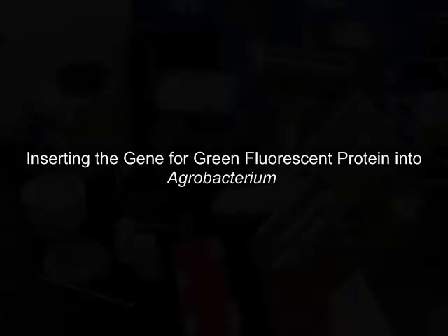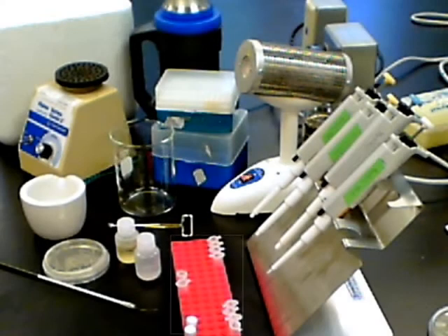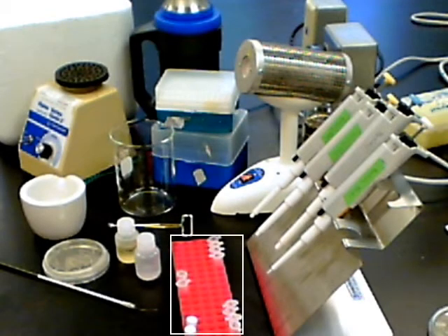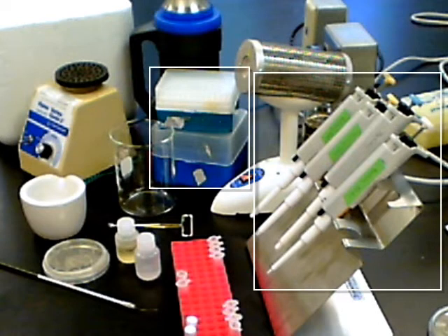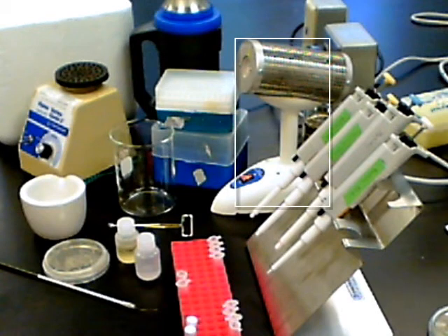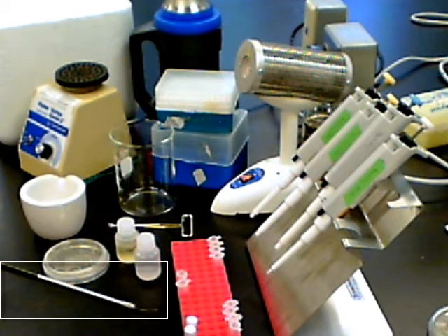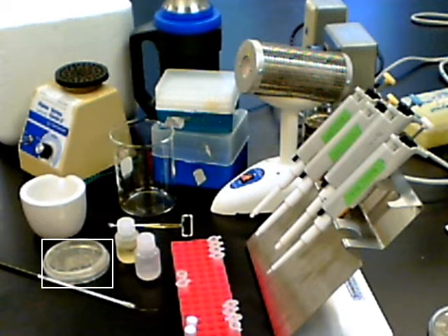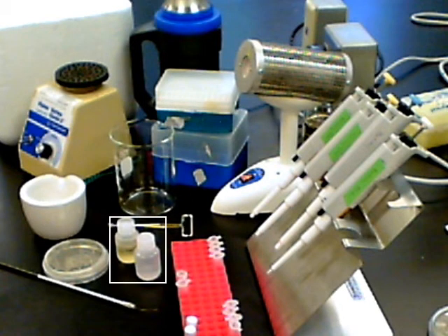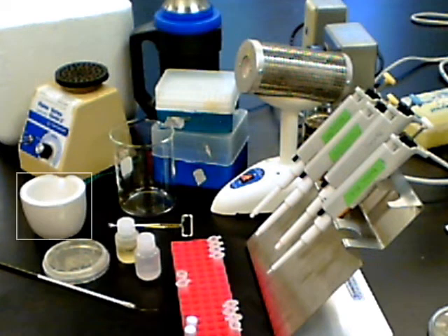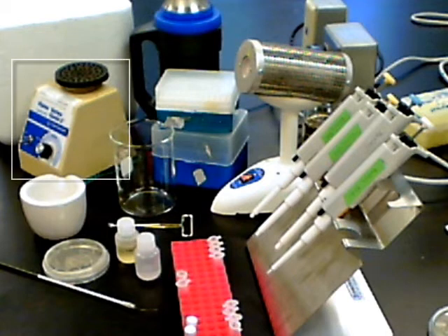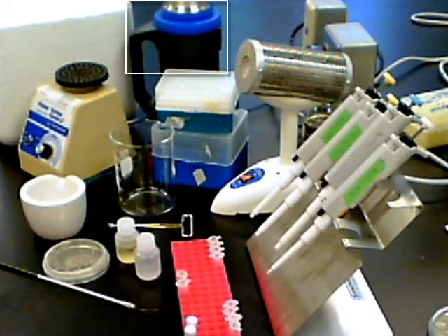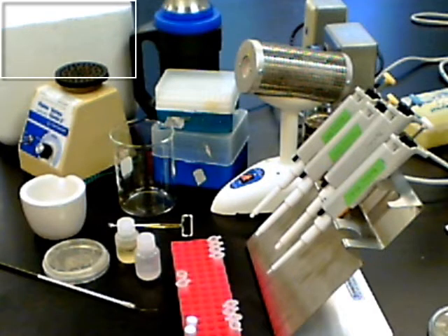The materials for this experiment include Eppendorf tubes, various sized micropipetters with pipette tips, a back decinerator, an inoculating loop, a source plate of bacteria (in this case we'll have three source plates), calcium chloride and recovery medium, a crucible, tongs, a vortexer, liquid nitrogen, and an ice chest full of ice to keep the DNA that causes green fluorescence cool during this experiment.